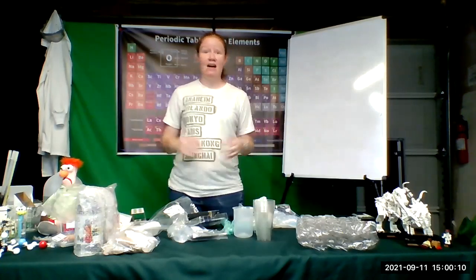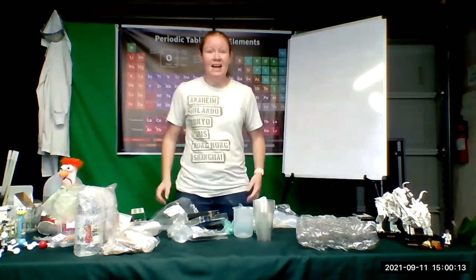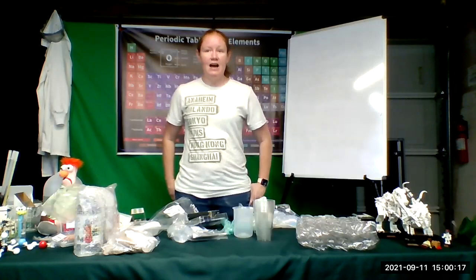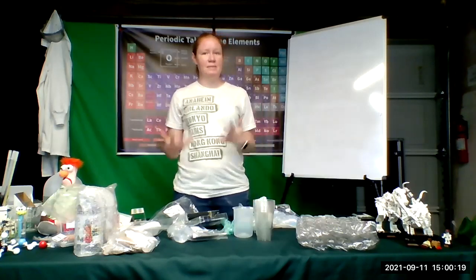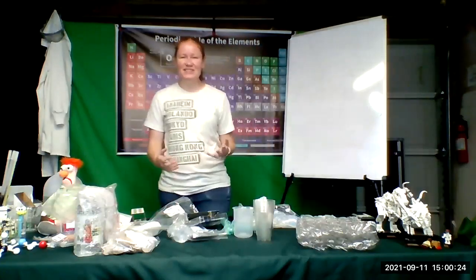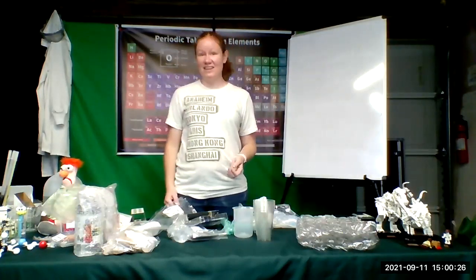I think it'll be good. The other students I've had this past year and a half that have used these kits have all been very excited about using them, because you get almost the same hands-on experience that you would get if we were actually back in the classroom.